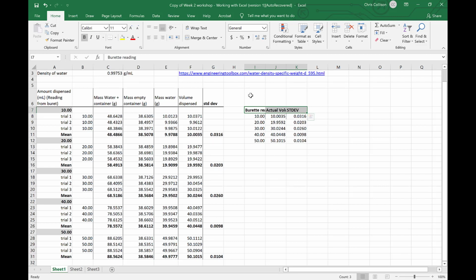I've got this is my X, and here's my Y, and this is going to be associated with my error bars. So now let's go ahead and plot the graph. I'm also going to remind you that it's always a good idea to save your file as often as you remember to. And I think it's worth saving every 5 minutes or so, maybe more frequently whenever you make an important change to the graph.